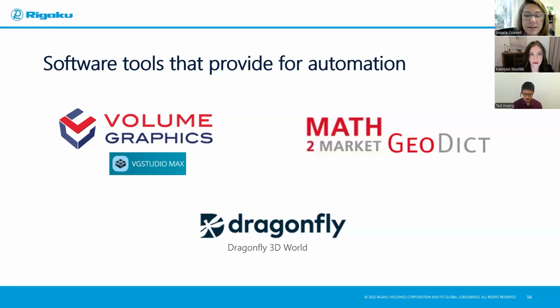And by the way, I don't know if you know, but yesterday, September 16th, the new version of Dragonfly 3D World 2025.1 came out, and I installed it and did confirm that everything I'm telling you and prepared in the weeks before is still true with version 2025.